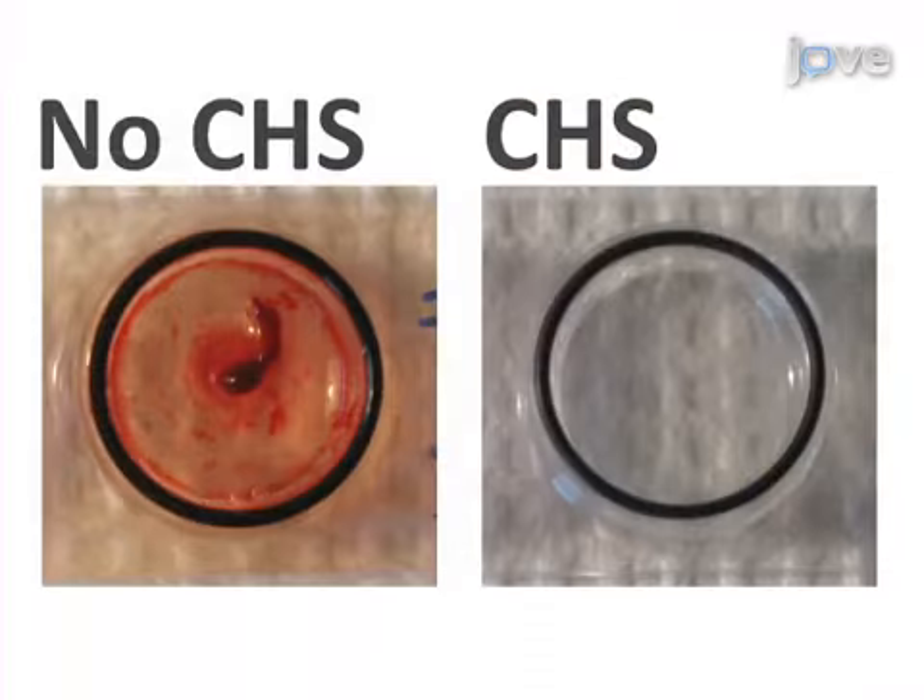For example, in this image a clot is clearly visible in this uncoated chamber after 30 minutes of blood contact. Treating the chamber with heparin surface protects the blood from uncontrolled activation, ensuring that the results are due to the endothelial cell blood interactions only.